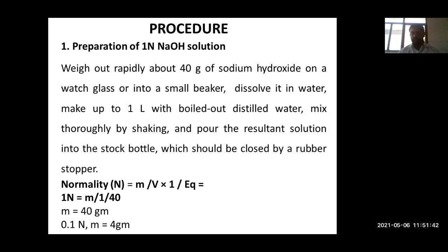So a one normal solution also represents a one molar solution. In the case of NaOH or monobasic acids and bases, the normality and molarity are the same.